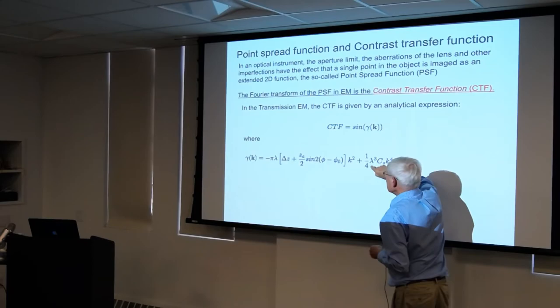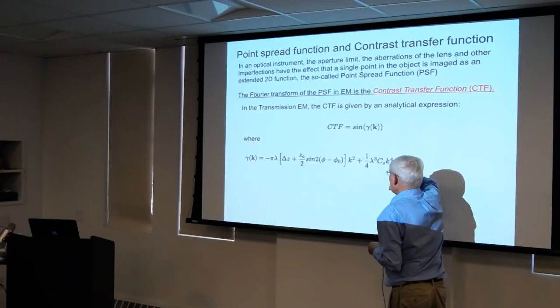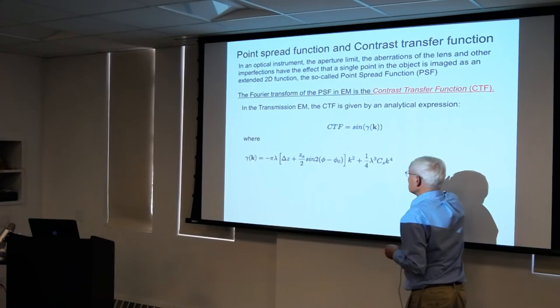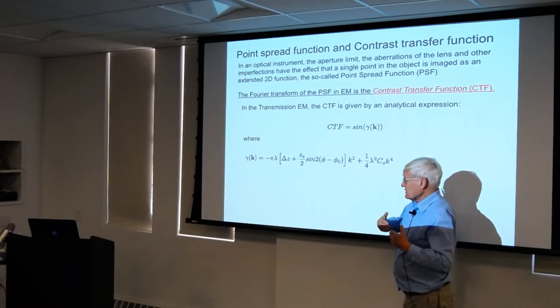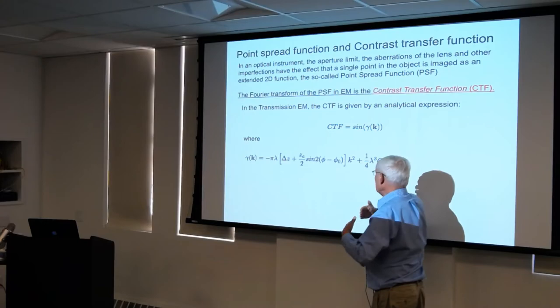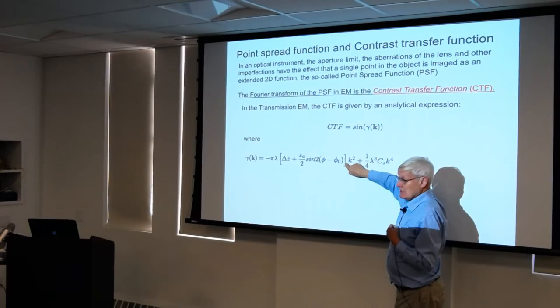And these are just, the wavelength goes in there. So what's interesting about this here is one term goes with minus, the other one with plus. The terms counteract each other, and it's sort of a pretty unfair play because this goes with the fourth power, this goes with the second power. So there's only one place where they're sort of a little bit matched.